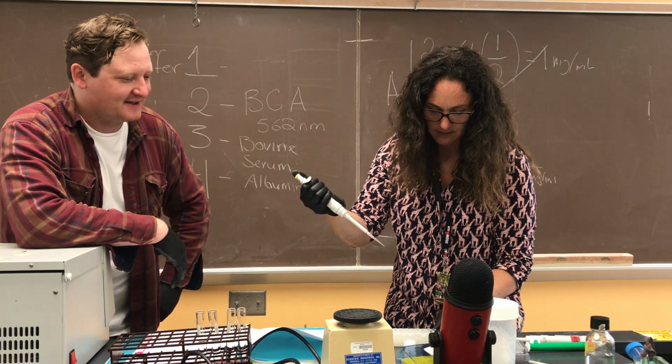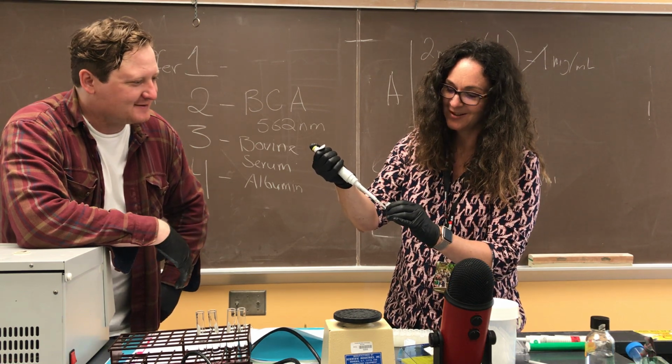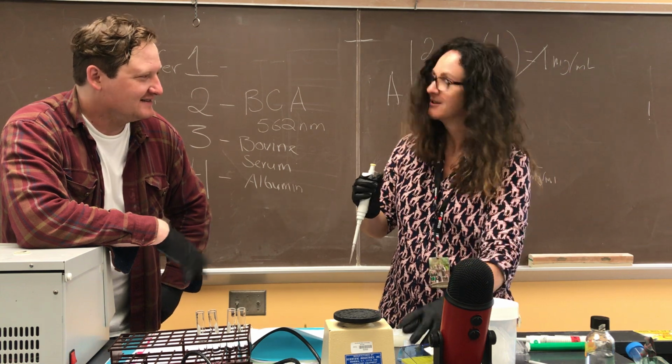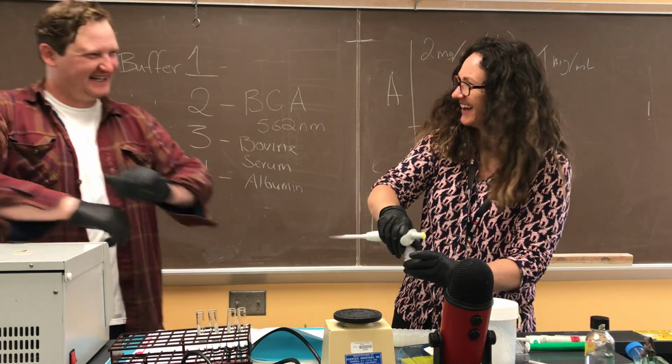Sometimes you just have an urge to smell things in this lab, and I don't know why. I'm curious what aroma that would have. I don't think it has any smell at all. That's bad, yeah, with the lab technique.